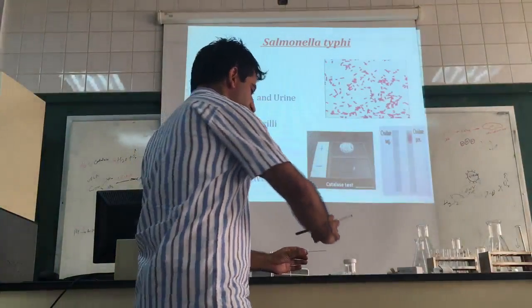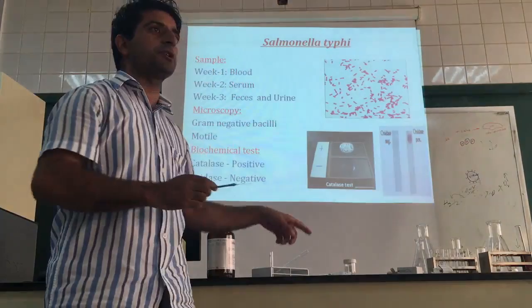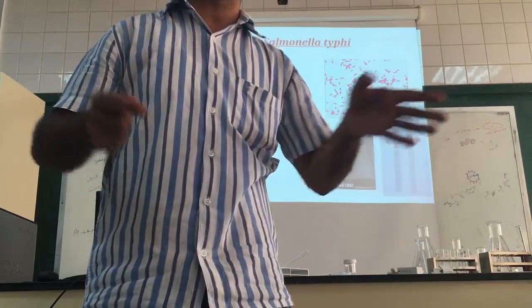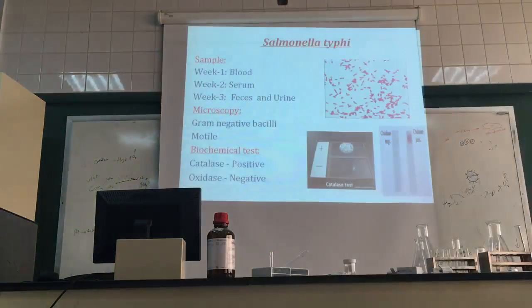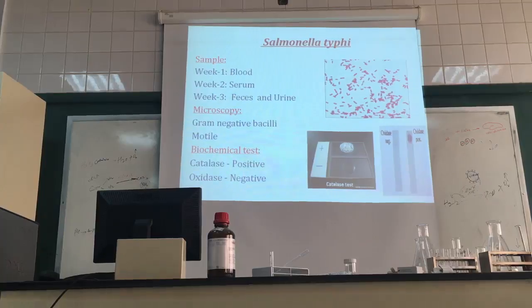Even in our body, we have free radicals, and they damage our cells. Similarly, hydrogen peroxide tries to damage the bacteria. But when the bacteria has the catalase enzyme, it immediately neutralizes the hydrogen peroxide into water and oxygen. The bubbles that are coming up are bubbles of oxygen. Please switch off the gas, because you cannot keep it on, it is risky in the lab. Fire issues.